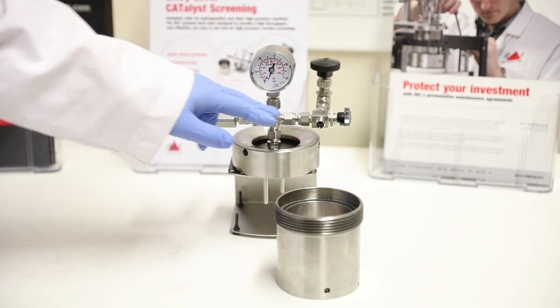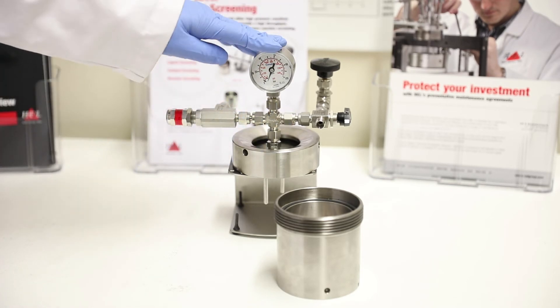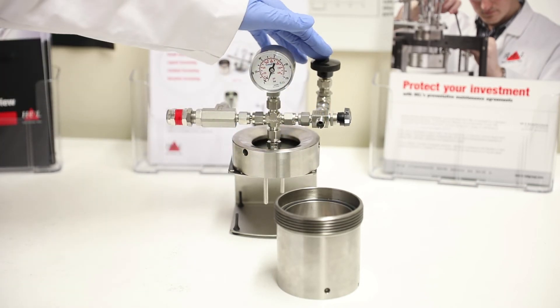Again, a similar sort of assembly, although it's a simpler manifold with fewer ports. The key parts are there: pressure gauge, relief valve, dosing valve, and let-down valve.